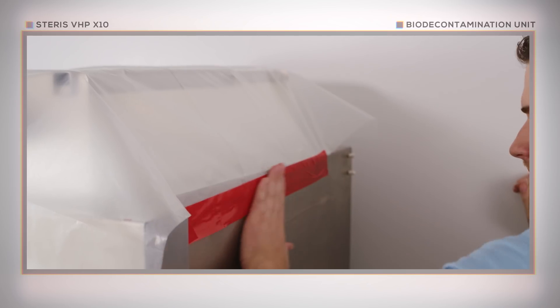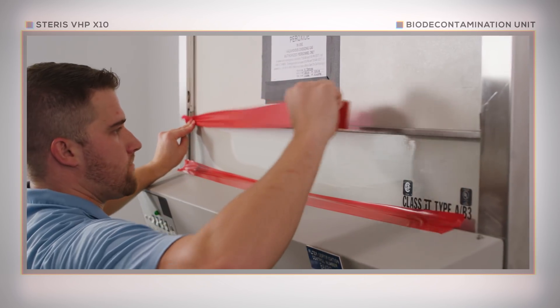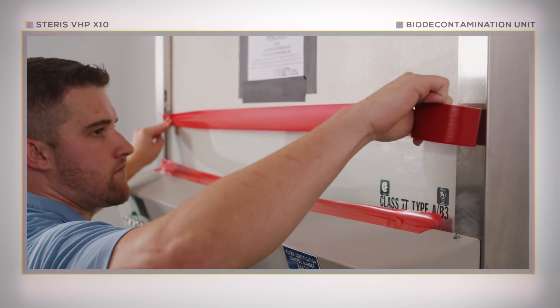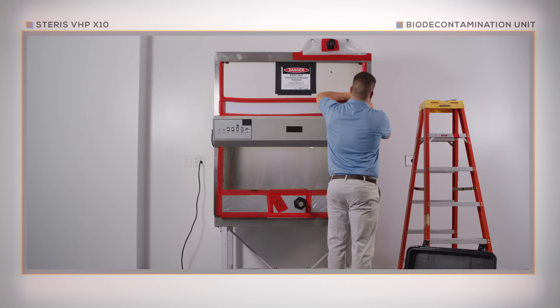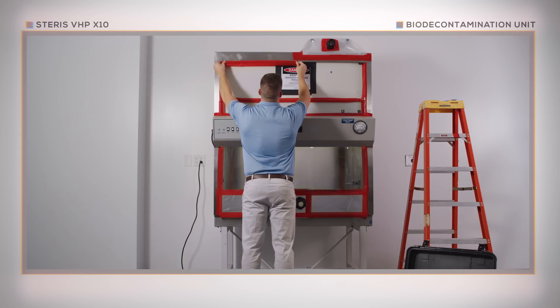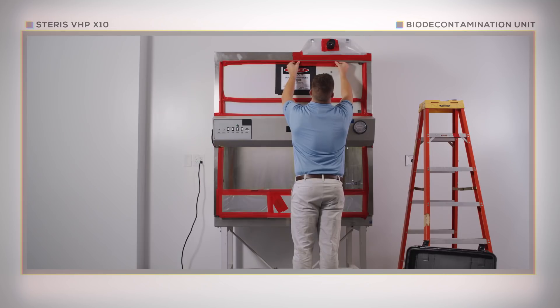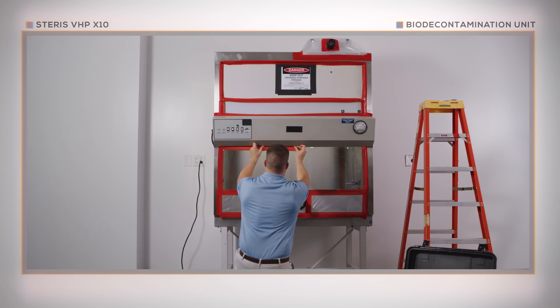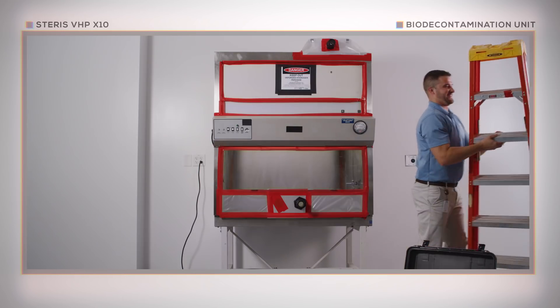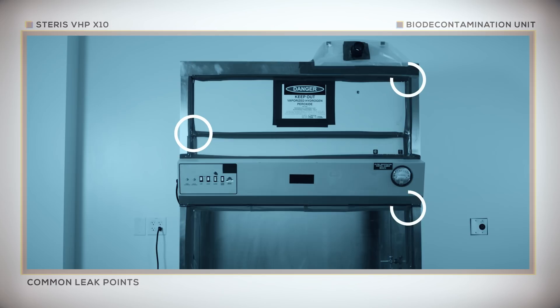Please note, the operator may need to remove the exhaust filter cover if installed. Additionally, the upper and lower sections of the cabinet should be sealed separately, so that air movement between the X10 outlet and inlet ports occurs only through the interior of the cabinet. Any leak points on the biological safety cabinet must be sealed using tape. Be sure to give extra attention to common leak points such as power cords, tubes, and edges of openings on the cabinet.